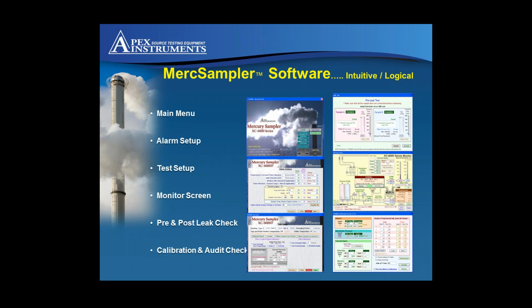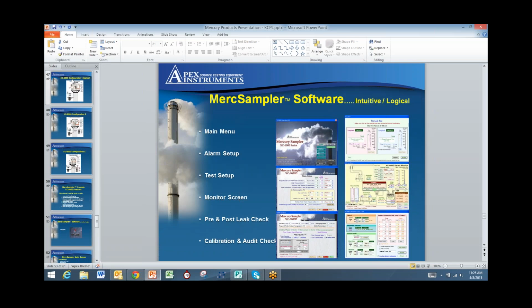So basically it's very easy to identify what we call A side and B side, and see where you may have issues with either vacuums on a particular side, gas meter readings, those types of things. We can pretty quickly identify if we're having an issue on a side, which one it is, and start problem solving from there. And the alarm code is very simple. It's a very simple key. It's the alphabet, ABC, and each one of those letters indicates an individual alarm, and what the action of that alarm is. So that's all in the CSV file, but it also flashes on the screen if you were looking at it in real time, and so, like I said, it's very versatile. Okay.